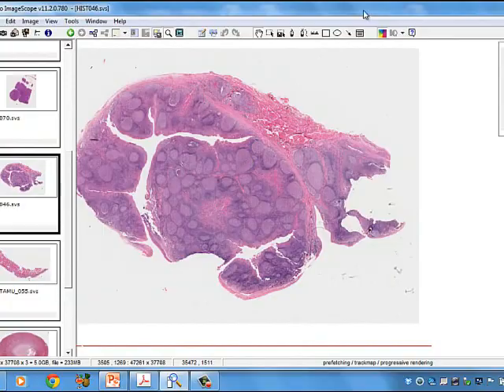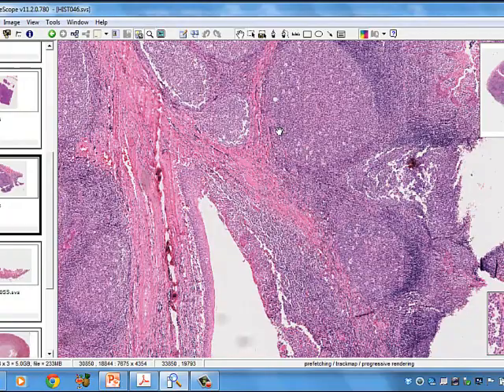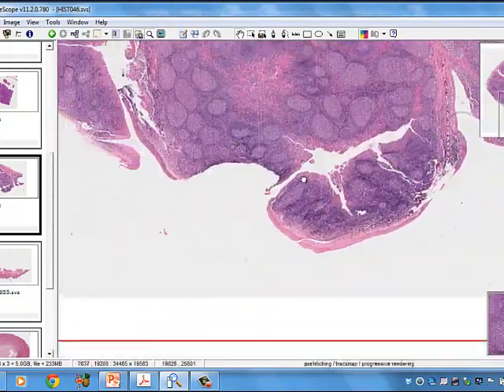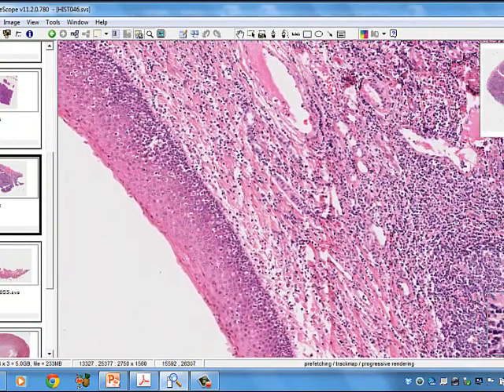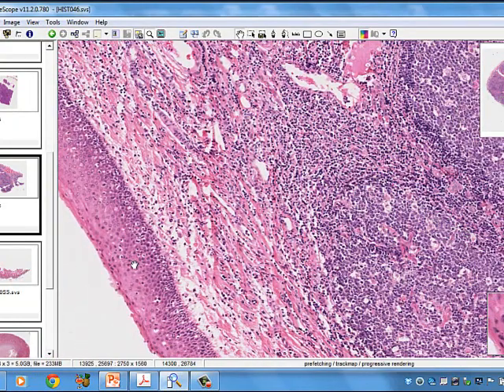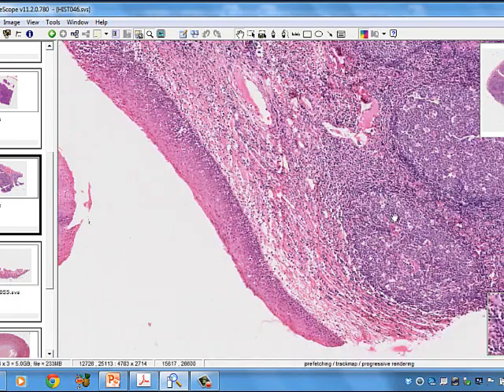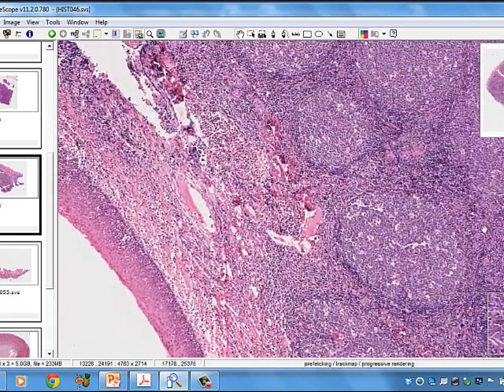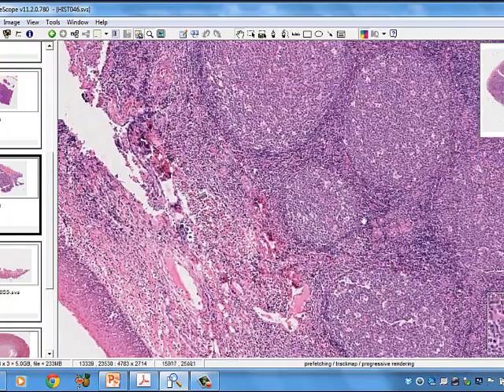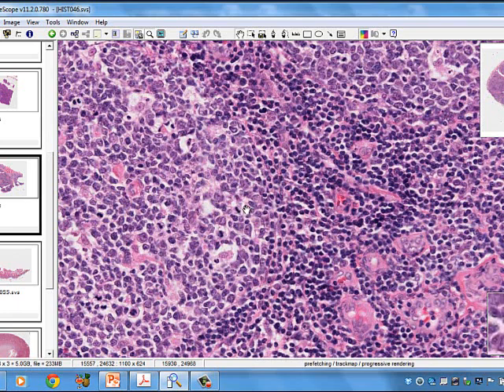We can see the germinal center. This is a germinal center, and we know this is stratified squamous epithelium here. And so if you have lymphoid tissue associated with stratified squamous epithelium, you've got to be in the oral cavity likely. You could have some in the trachea too, but it's mostly going to be, especially this high density, tonsils.